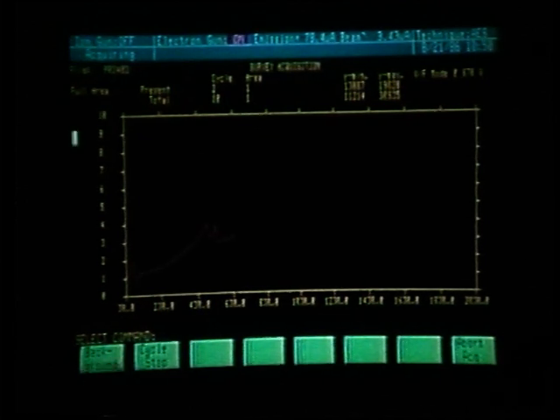In the N of V mode, we are seeing the low energy copper peak, we see the chromium peaks, and the higher energy copper peaks. At this point, I do not see any contaminants. I do not see the presence of any oxygen, any carbon, or titanium. But again, to fully evaluate that, we need to differentiate the survey scan and look at it in more detail.